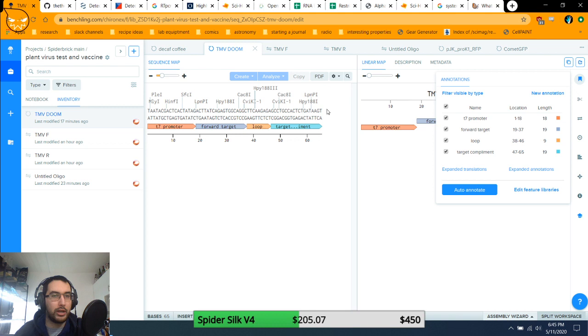Technically. But the way I've been thinking about this is, I need RNA letters so I can have this piece made. I can take the plasmid from Free Genes and express it in some E. coli so that it's producing T7. I can collect all those bacterial cells, pop them open, and strain it out so that I've got an active solution of T7 polymerase, which would be really cool.